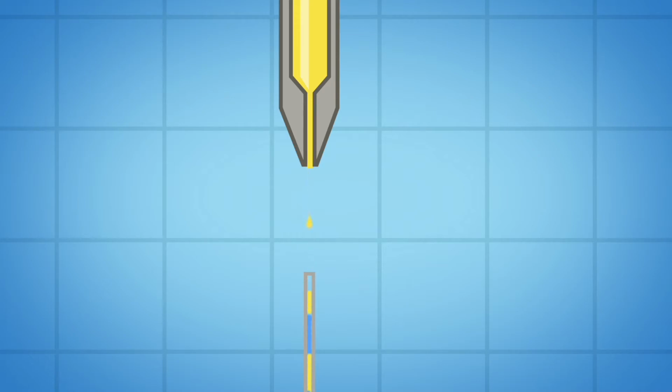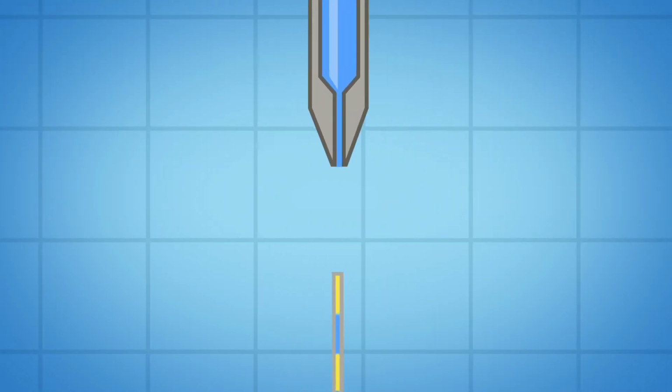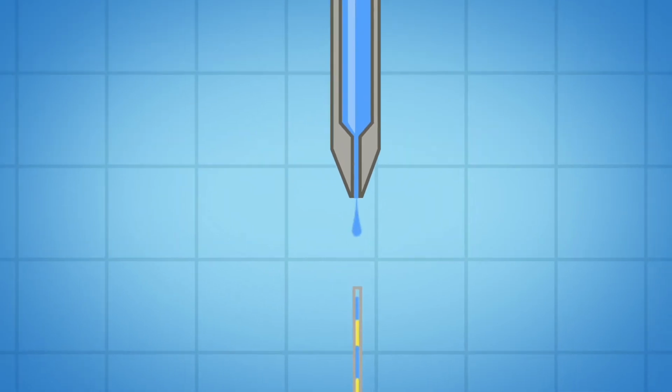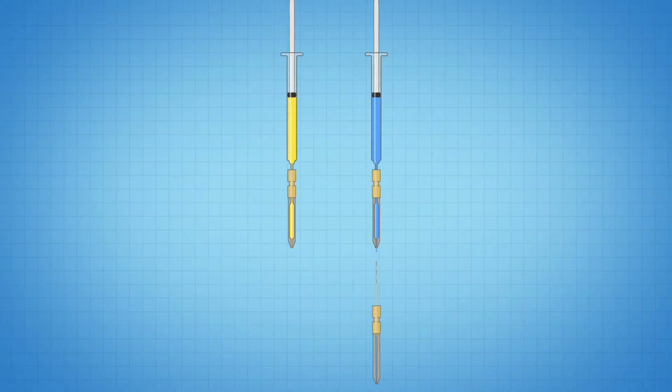The oil spacer is ejected into the collector tube by the oil injector. Then the next sample is ejected and concentrated into the collector tube as described. This continues till the collector tube is filled to its capacity of sample segments.